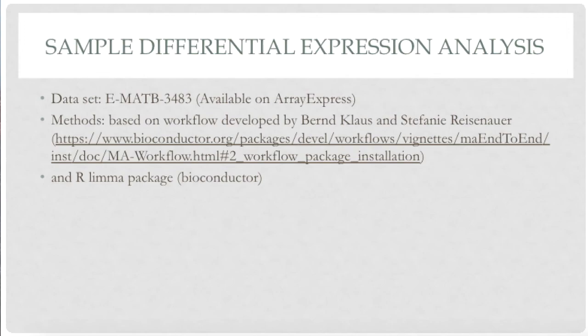Now, some final words of caution before we pull up the RStudio window is that this webinar is really meant to be a very basic introduction on bioinformatics and differential expression analysis. So the data set I chose reflects that goal because it really is very simple in a lot of ways. For example, it only has four samples and one independent variable feature. And as a result of that, we will not be getting into many of the challenges that will arise once you get started on analyzing more complicated and advanced data sets.